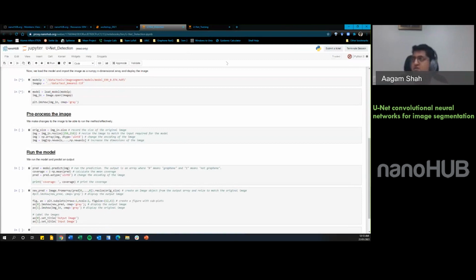While we're waiting, I think I will look at the questions quickly. No, we don't make any changes to the neural network architecture to process the binary images per se, since the input consists of two images, the raw SEM image and the binary mask.